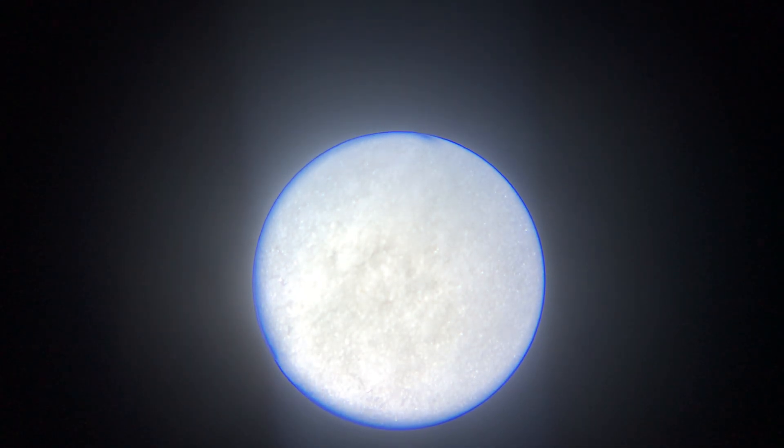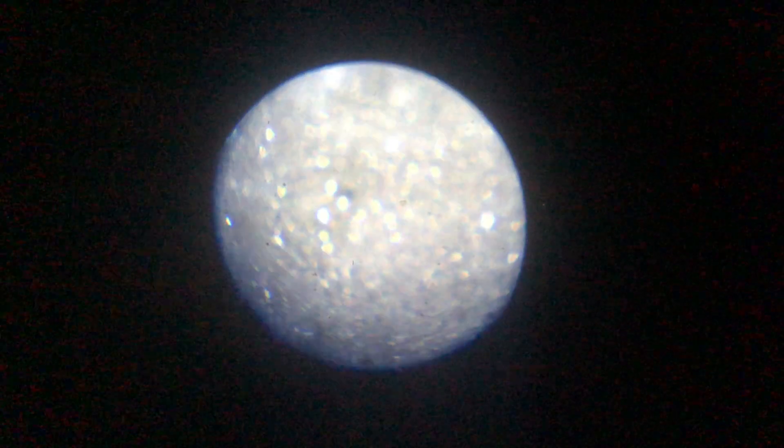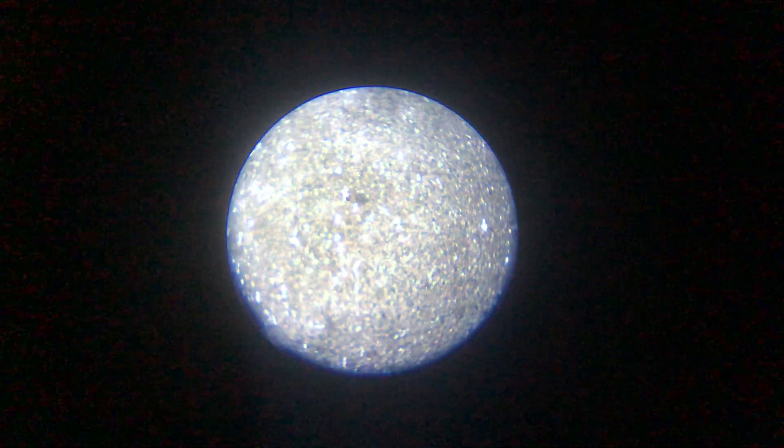Okay, so this is your borax. Now let's go to the bentonite clay. I'm looking at this through the monitor and this does not look anything near to what you can see with your own eyes, so I apologize for that. I didn't plan on doing this today, but here we are. That's your bentonite clay. And let's go over here to the charcoal — this stuff is the best, and that's going to be really hard to see, especially since charcoal is black anyway.